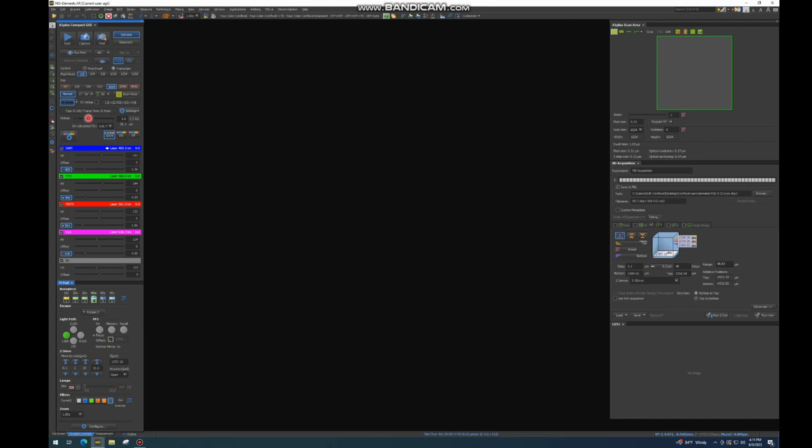Down here, we get into pinhole. The pinhole is really vital for the confocal, and it's what makes the confocal a confocal. What that means is that it allows you to focus the light on a very specific slice of your sample, without getting signal interference from above and below that plane. So for that reason, you need to have the pinhole very small so that the laser light is focused in a very small region.